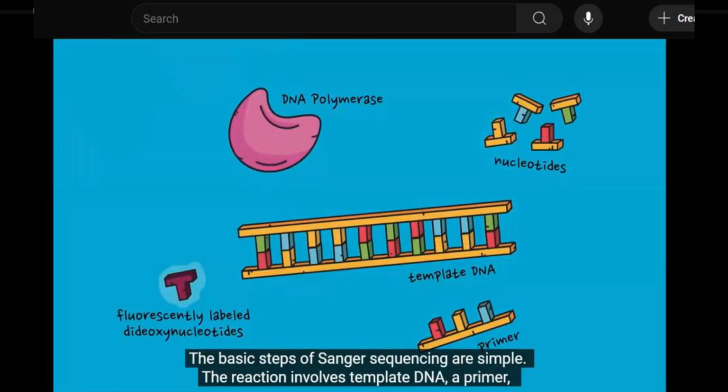This is DNA polymerase lengthening the DNA strand, and because the ddNTP is added, which does not have a 3' hydroxyl group, further bases, even if they come into the series, cannot be added. So this is ddNTP, which does not have a 3' hydroxyl group. So here you have so many reactions for each molecule going on, right?